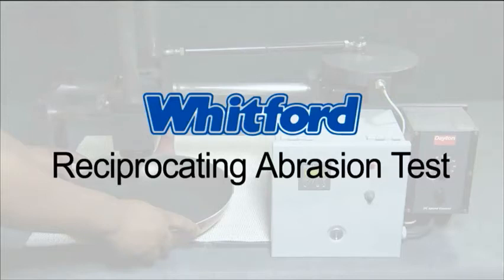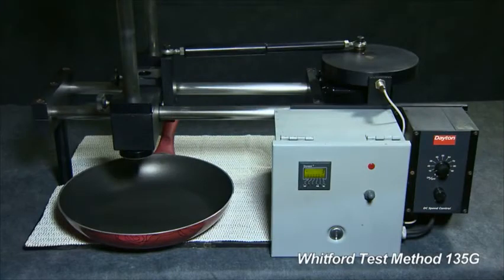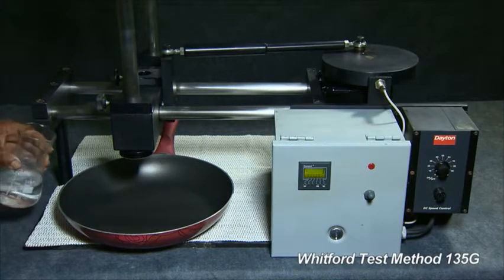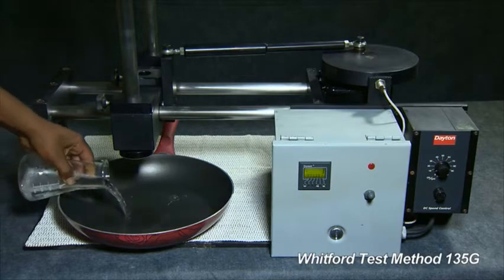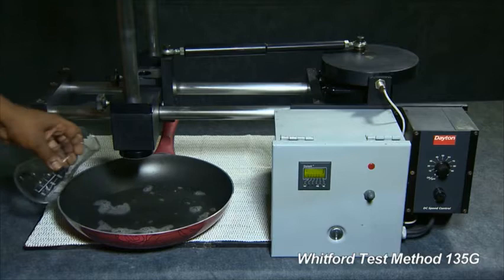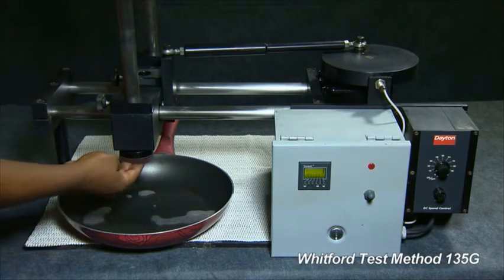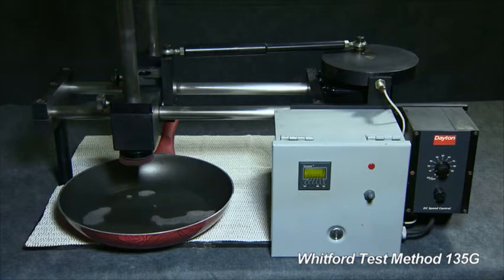This is Whitford's Reciprocating Abrasion Test. Place a pan onto the machine so it cannot move. Add water with 0.5% Triton X100. Cut a standard Scotch-Brite pad and attach the pad to the stylus. Set the length of the stroke to 4 inches.